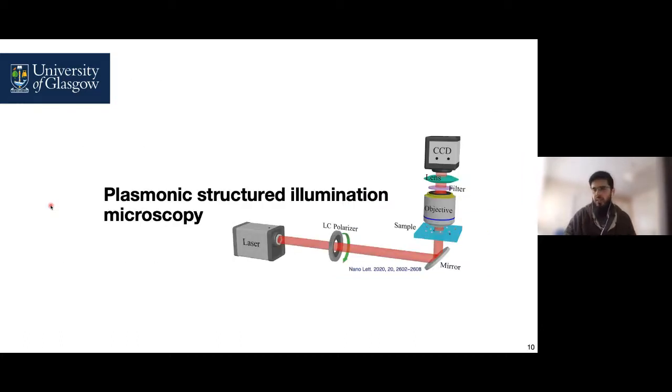Now let's combine and aggregate what we have seen and see how it can be applied in developing high resolution microscopic techniques.